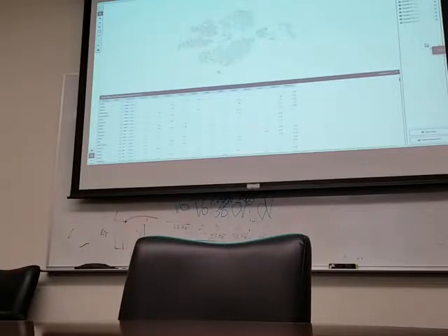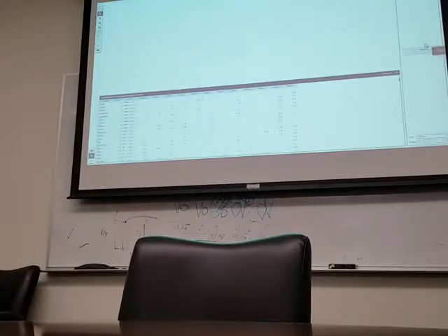I took that spreadsheet of the joined heavy light chain sequences, and there's about 2,000 rows of cells that have BCR data with both heavy and light, although some of them were missing heavy and some were missing light. So I just threw those out. There were some that had V gene calls or J gene calls that were concatenated by semicolon, and the V genes were very different, like V169 and V323. I eliminated those. So I'm left with about 1,600 cells that have complete receptors.